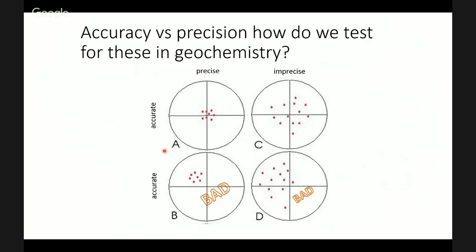And then kind of lastly, we need to think a little bit about precision and accuracy. Okay, so we mentioned precision, and that's basically your ability to measure the same thing over and over and over again, and get the same kind of result. And that could be, if you measure the standard solution on the mass spectrometer and you repeat that many times, you could think of that as the reproducibility of your mass spectrometer.